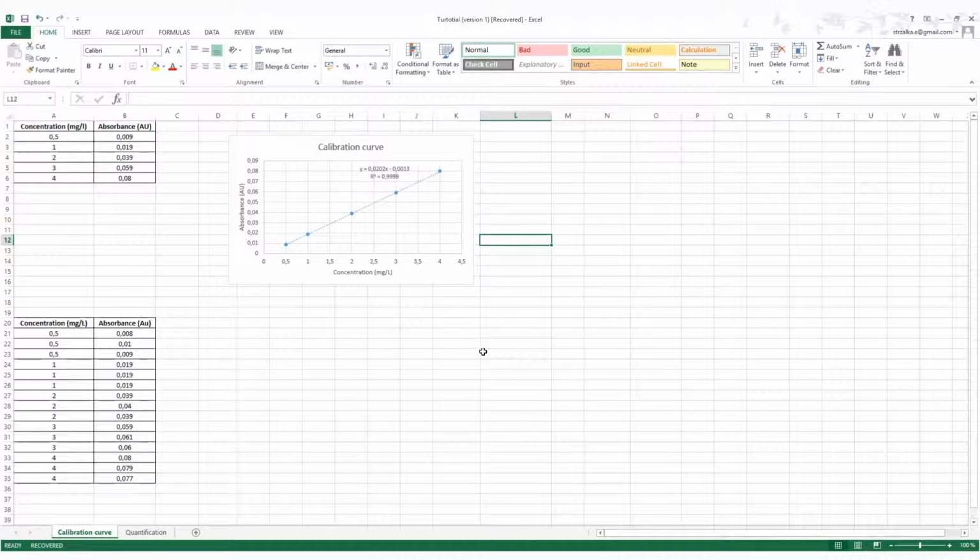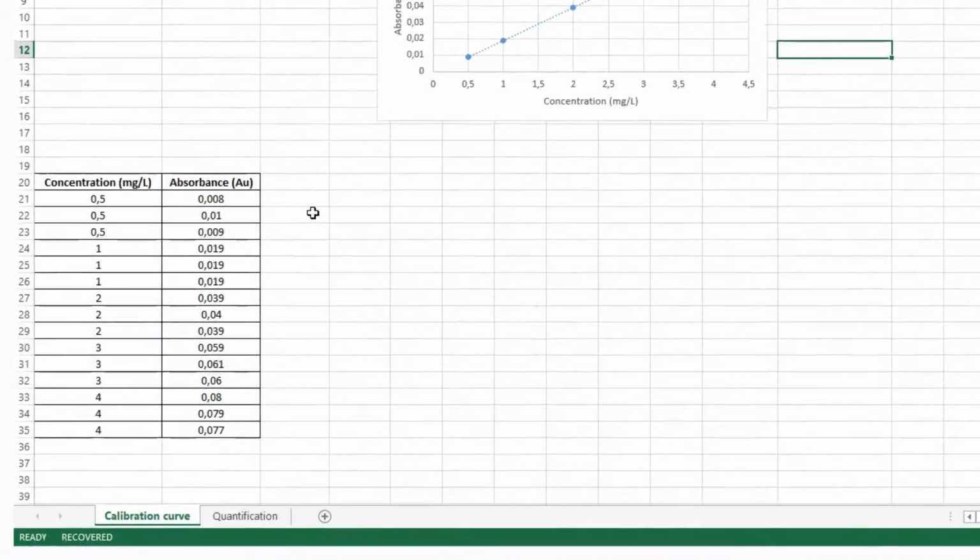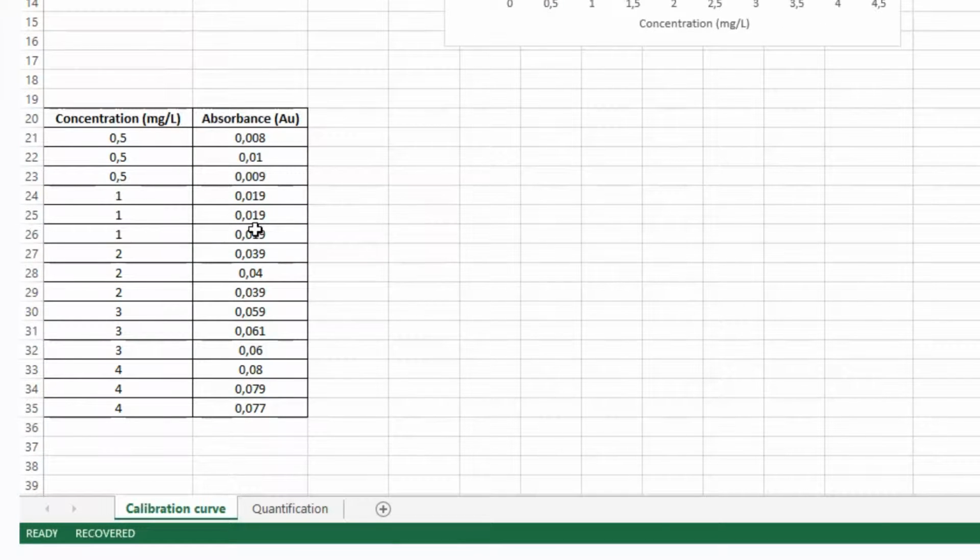It may happen, however, that you will have 3 y values corresponding to 1 x value, as it is presented in the second table. For example, you will do 3 measurements for 1 calibration standard, and in such a situation you shouldn't use the average of the instrument's signal or response to create a calibration curve. So in this case you don't take the average of the absorbance to create the calibration. Instead you should place all the y values on the graph.